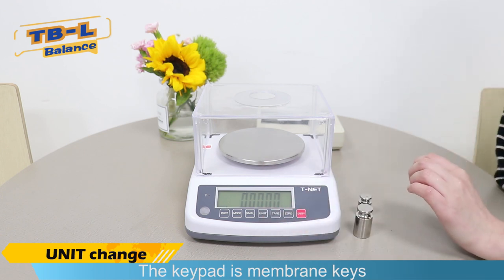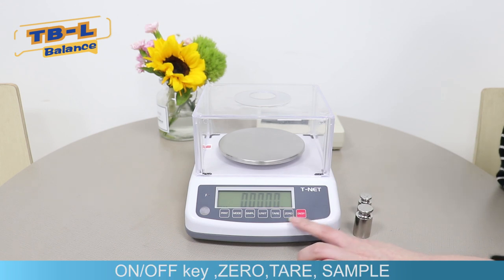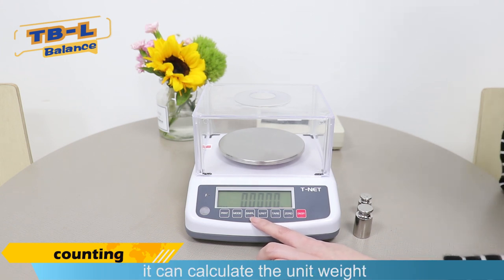The keypad is membrane keys. Besides the unit key, it has on/off, zero, tare, and sampling keys. The sampling key is for the counting function — it can calculate the unit weight.